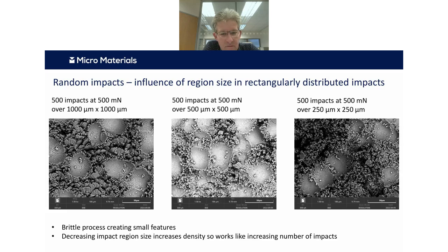And so you're going from, on the left, you're seeing that columnar structure between the impacts, and in the middle it's starting to be broken up into much smaller pieces, and then on the right you're getting really this sort of filigree type structure. And you end up with a few of these compacted impacts in the end, but most of the original impacts are now being covered up by the debris. And that's not an entirely uncommon situation for an erosion scar, where essentially you're just seeing the result of the last few impacts.